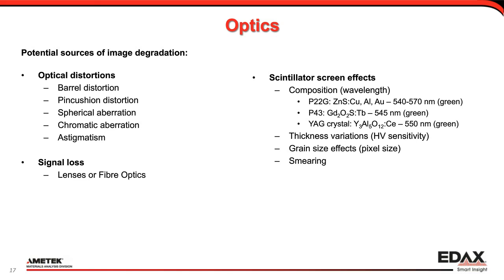There's not really phosphorus in there, but it's the phosphorescent effect that transforms the electrons into light. And you can see that they give out a certain range of wavelengths for light. And that light is then going through the lenses, and having the narrowest wavelength range as you want gives you the sharpest response from the lenses.